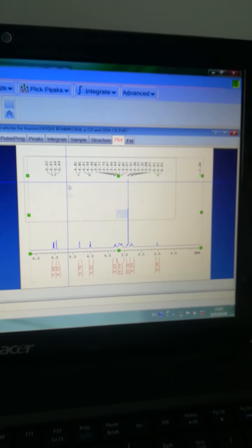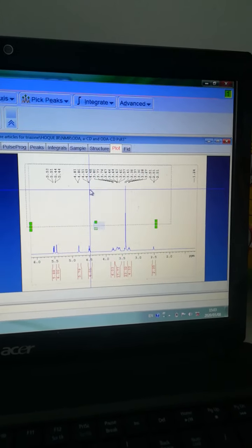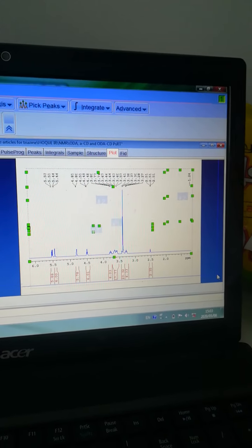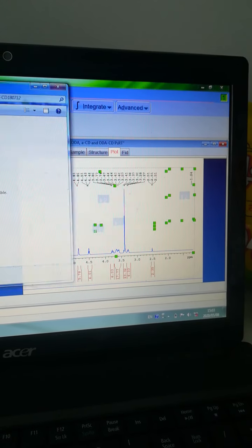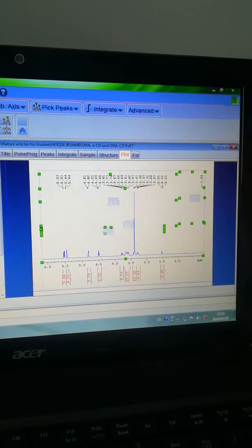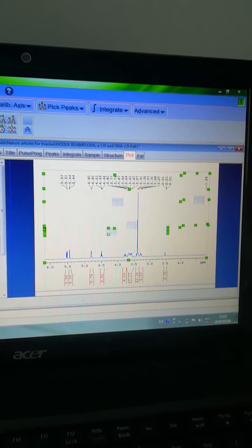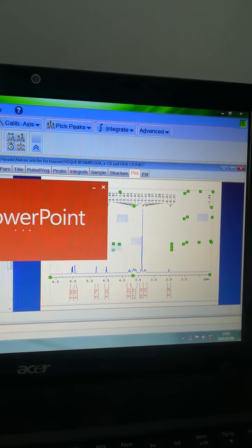Now you can either copy using marking, or just by clicking here, here, and here. You can see the region defined, and then you can copy directly to your, how to say, PowerPoint. You can copy it to your PowerPoint, or you can do another thing, which is publish.